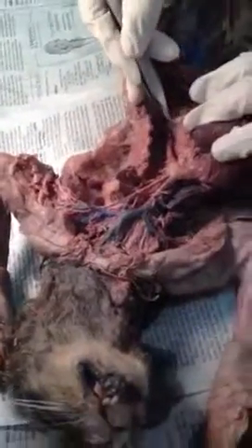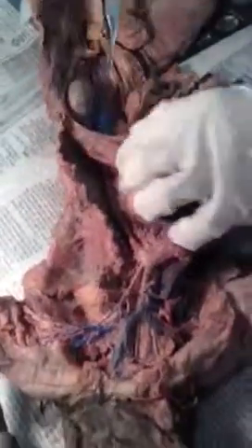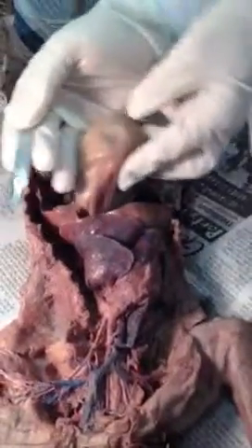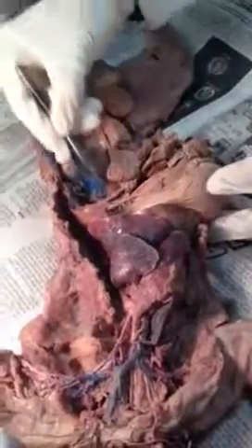And down here, this is your descending aorta coming down. Okay. Over here. Oh, it's a descending aorta? Yeah. And then we have pulled all the organs this side. So in the picture I put it that way. The celiac trunk, you remember? Then the hepatic, gastric, splenic. So now it should be this way, like in the picture, but I pulled it over this side.